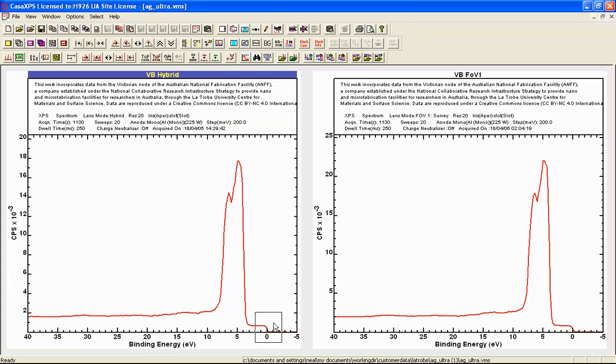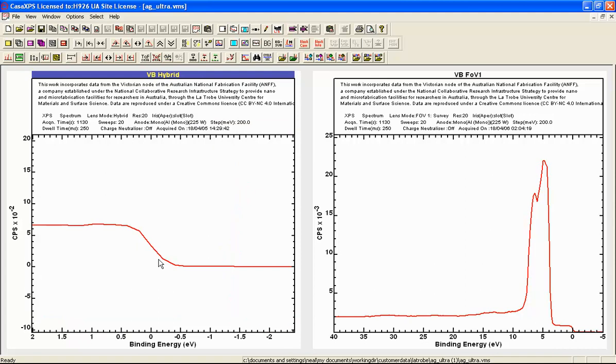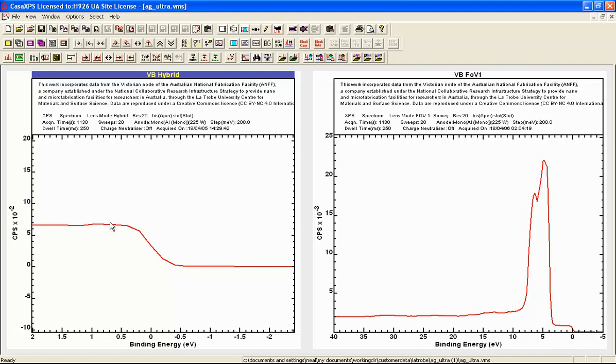We will do this by measuring a step that represents the Fermi edge for silver. The objective is to fit a curve to these data that will provide a position and also the interval over which this step occurs. The interval over which the step occurs provides a measure for the resolution of the instrument. So we need to apply the same procedure to both of these Fermi edges.